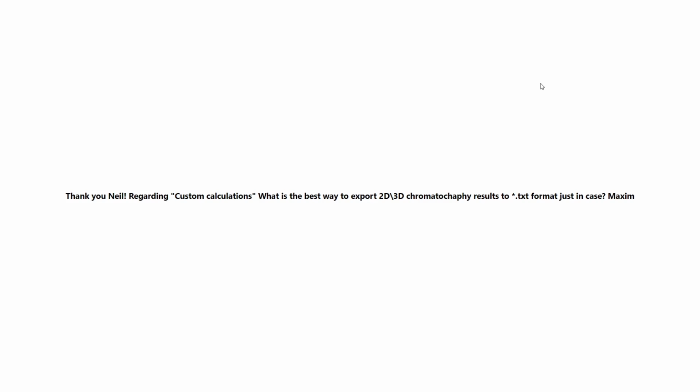If it's a table of information, you could export it in ASCII format as well. And you can export individual results, or you can do a summary of results. And for reports, you have EMF, ASCII, and PDF. So I think for raw data, it's really a choice of ASCII and or AIA.